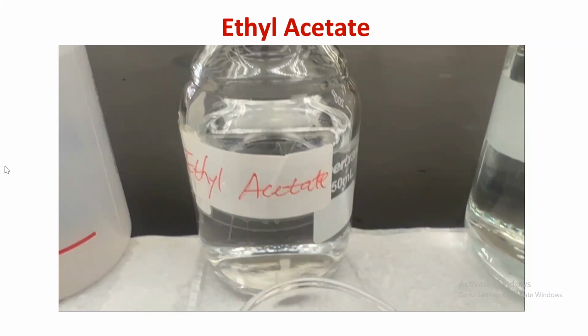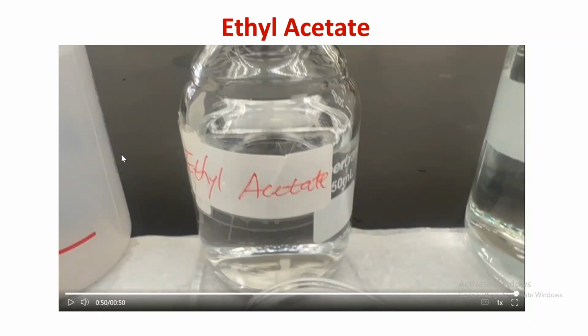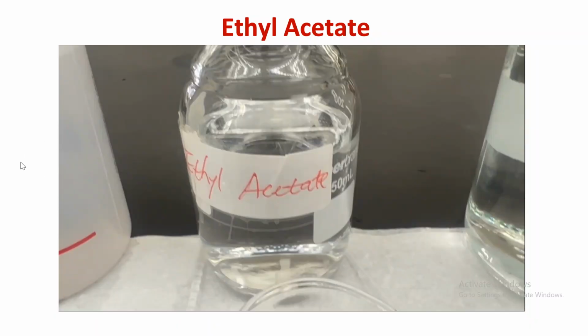So for the conclusion for table one, we're going to write it's immiscible, means they do not mix. And ethyl acetate actually formed the top layer. It was sitting on top of water. So the question that I'm going to ask you, if it's on top of water, is it more dense or is it less dense? Correct. That means it is less dense. So fill out your tables accordingly, table 1, 2, and 3, and then we'll move on to our next liquid.